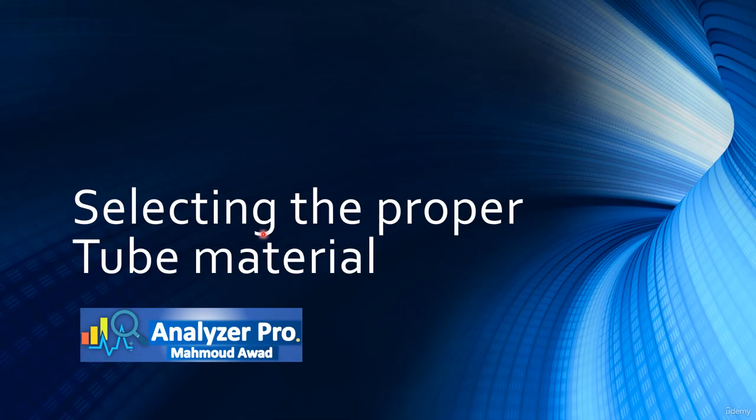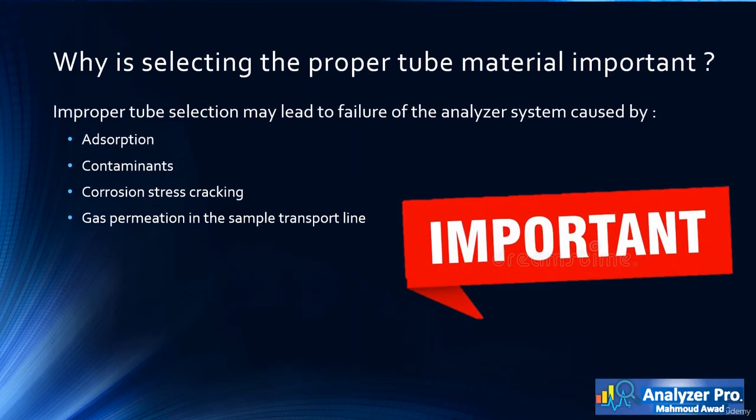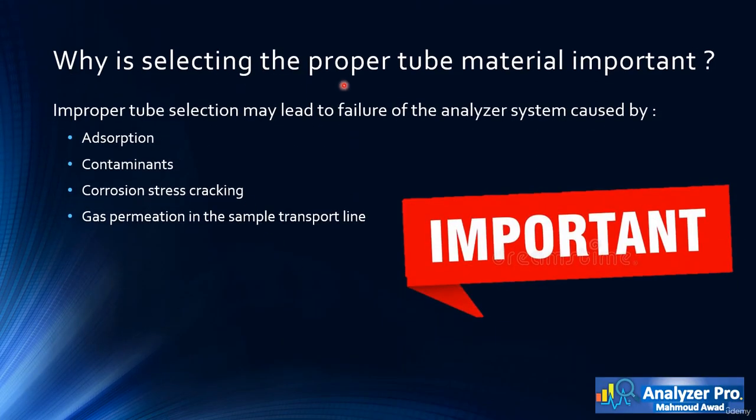In this lesson we will learn to select the proper material to use for your sample line. But why is selecting the proper tube material important in the first place? Improper tube selection may lead to failure of the analyzer system caused by adsorption of the sample in the tube material, contamination of the sample fluid, corrosion, stress cracking, or gas permeation in the sample transport line.